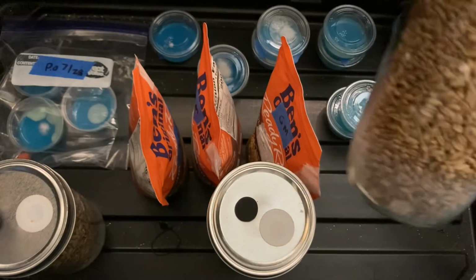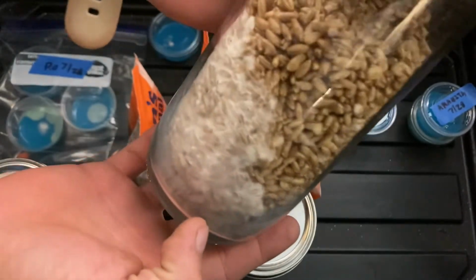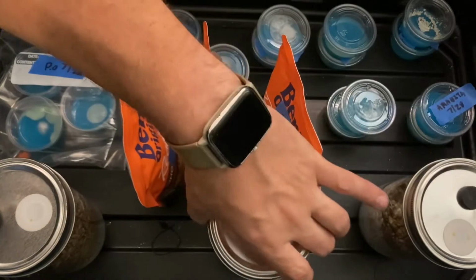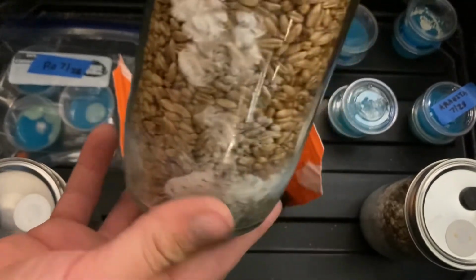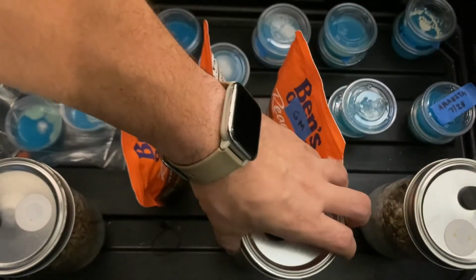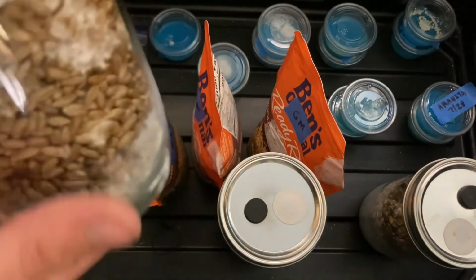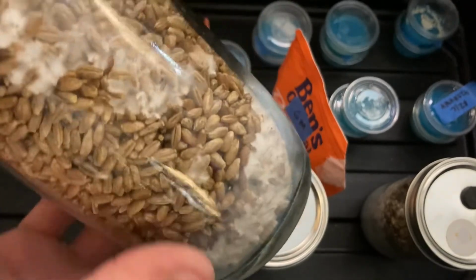But we have some good growth going on in the jars. So I did do these rye berries myself. I just reused the jars. Some good growth going on in the jars. And everything in here, except for the petri dishes, was done with a liquid culture and has been in here for about a week. Alright, so that does it for that step.